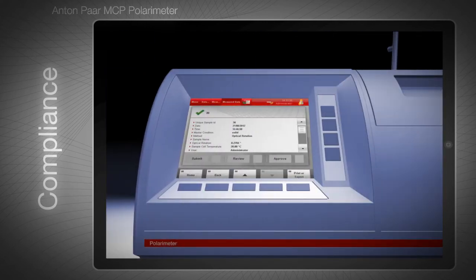The MCP has an integrated three-step signing process for measured data. If you activate electronic signature, selected data can first be submitted for signing, then reviewed, and finally approved. In this case, data export is only possible for completely signed data sets. The rights to sign can be defined for each user, and the signature can be set to require a password.